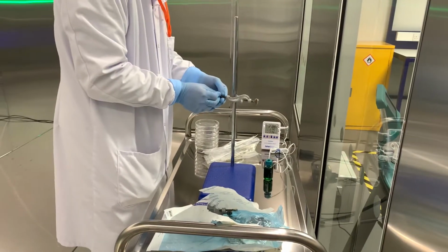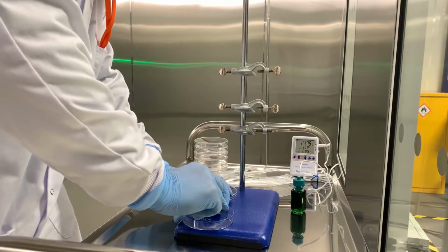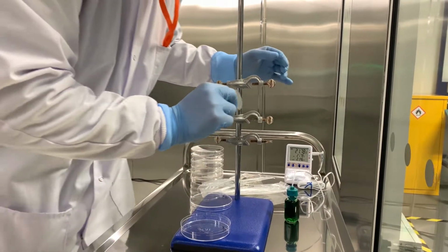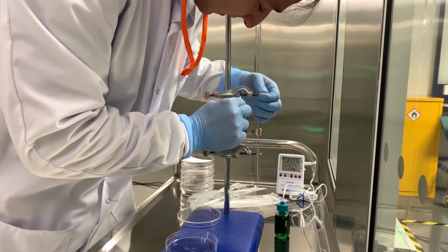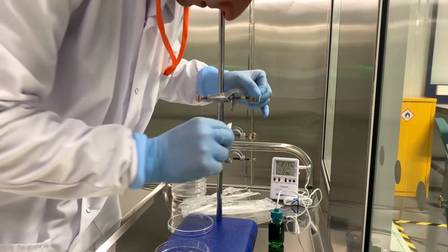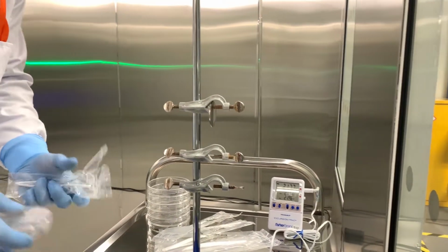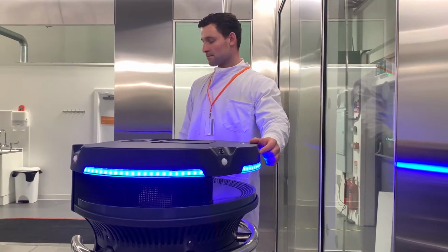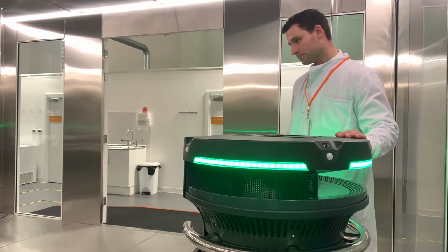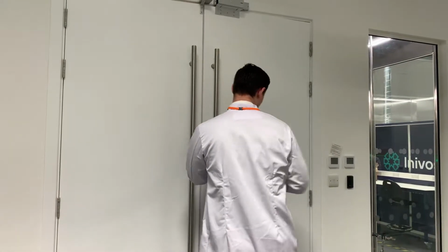Here, triplicate carriers for each test organism are clamped with the inoculum facing away from the release source at a standard distance, at a height between 1 and 1.5 meters. Duplicate control carriers are left inside the petri dishes and transported to a chamber with similar environmental conditions as per the test chamber. All of our test chambers can measure relative humidity, temperature, and hydrogen peroxide ppm. Once everything is set up and the initial required environmental parameters are achieved, the decontamination cycle can start.